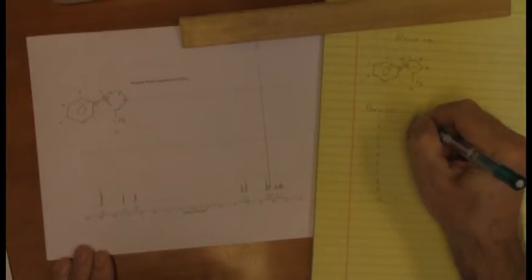It's almost certainly 2 different protons just very close together. And sure enough, one of them, the most downfield one of the bunch, looks like a singlet. All the others have some sort of coupling pattern to them. And if you look at the structure, position 1, that proton has no neighboring protons, so it ought to be a pretty decent looking singlet. Therefore, I am pretty confident that I have nailed the proton at position 1. It is the, I'll call it 8.5 ppm.